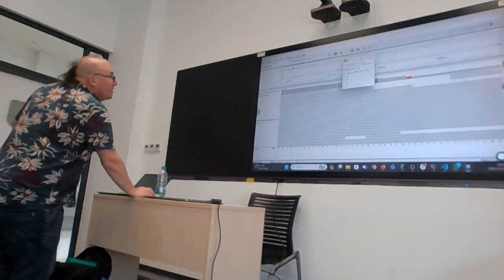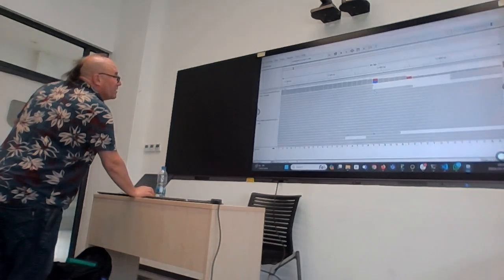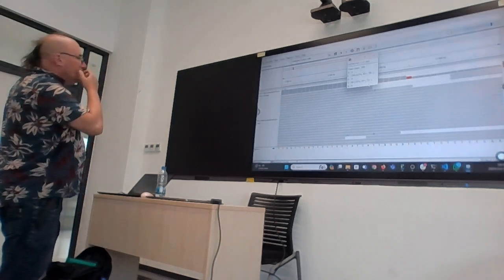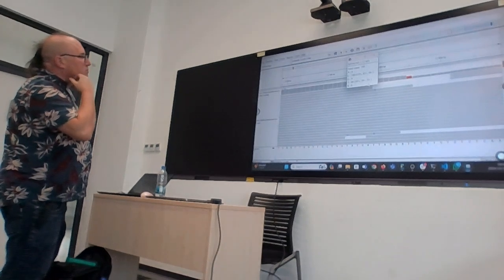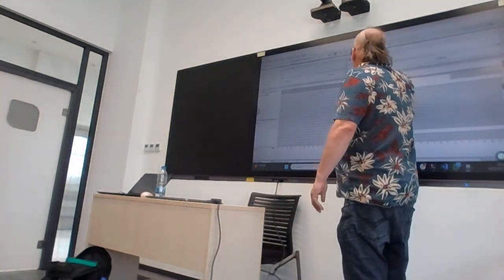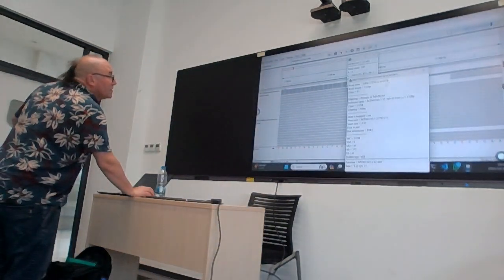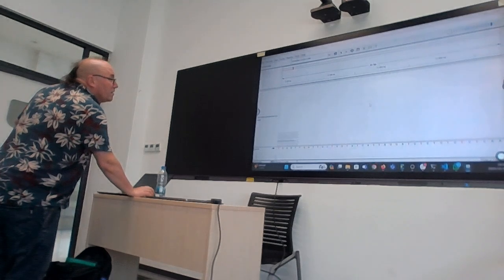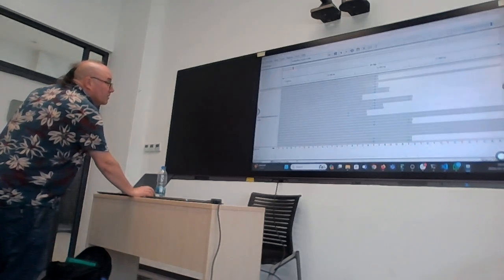But here, some of them are showing C. And if we go down, I don't know why we're only seeing a few showing the C, but it's showing that the 60% of the reads here are 38% to the, 63%. I'm contradicting myself. 100 of the reads are showing C, okay? So if we scroll down, we should see more. I don't know why I'm only seeing a few in this view. Hang on. Scroll down, huh? There's, you see there, C, C, C, C, C, C, C, okay?